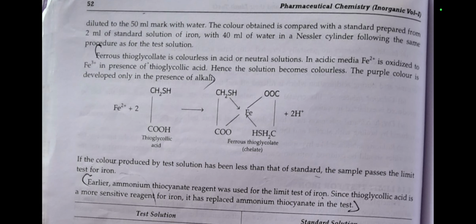Let's see the reaction involved. Ferrous Fe2+, when treated with thioglycolic acid, is converted into ferrous thioglycolate. Only in the case of alkaline medium will the color develop. In the case of acidic medium, the solution becomes colorless.